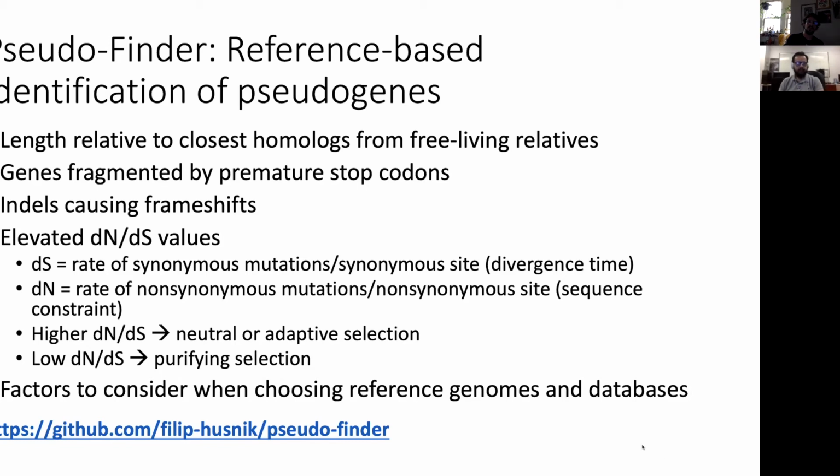In the case of my research, I use 0.3 because of the bacterial clade, the Sodalis, that frequently infects insects and becomes an endosymbiont. There was a paper that came out a couple years ago, and they did some analyses and concluded that 0.3 is the optimal number to draw the line at what's a pseudogene and what's not a pseudogene. But I think it's different for different species and taxa.